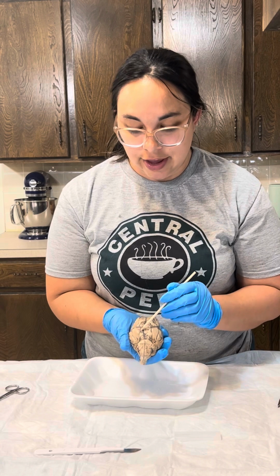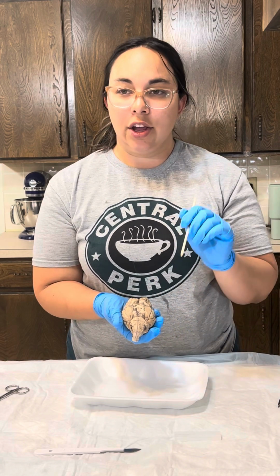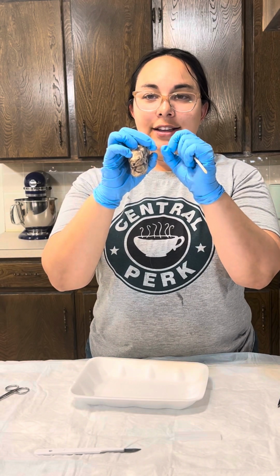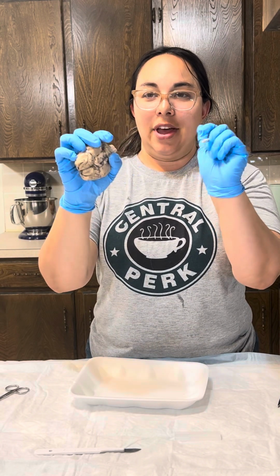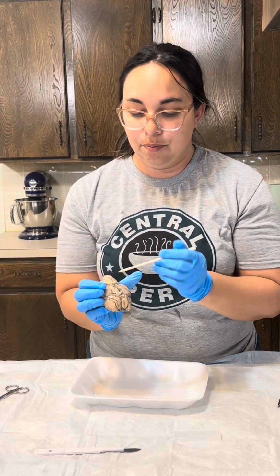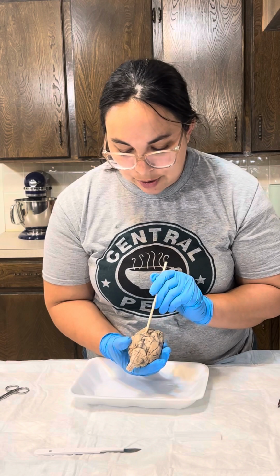And right above it, you can maybe see it, it's a little X right here. And that's where the optic nerves crisscross. When you look into your eyes, there are nerves that come from the back of your eyes, and then they crisscross in your brain area, and then they send signals. You can kind of see there's one piece, and there's the other piece right there.